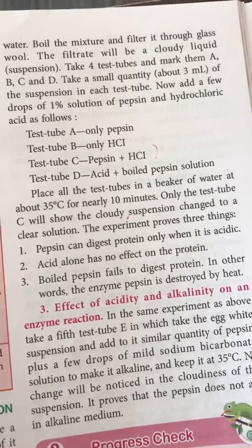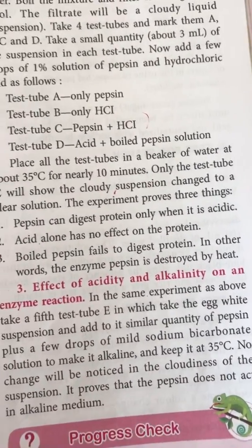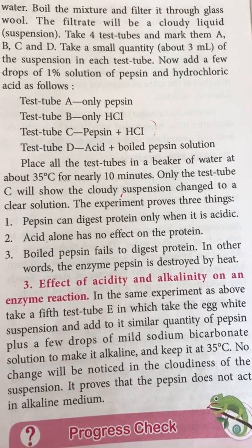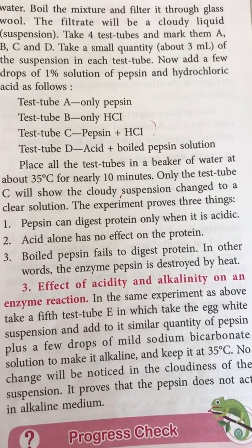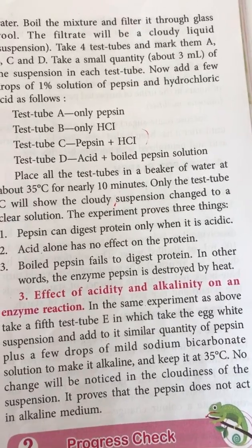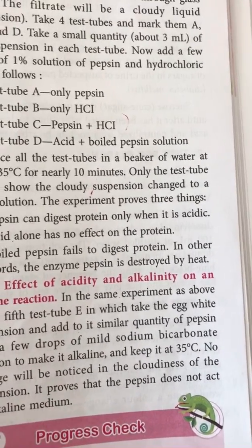And now add a few drops of 1% solution of pepsin and hydrochloric acid as follows. In test tube A you will add only pepsin, in B you will add only hydrochloric acid, in C you will add pepsin and hydrochloric acid, and in D you will add acid and boiled pepsin solution. Now place all the test tubes in a beaker containing water at about 35 degrees Celsius for nearly 10 minutes.